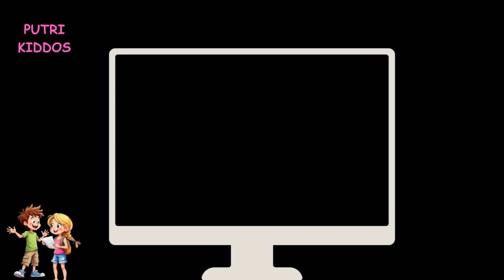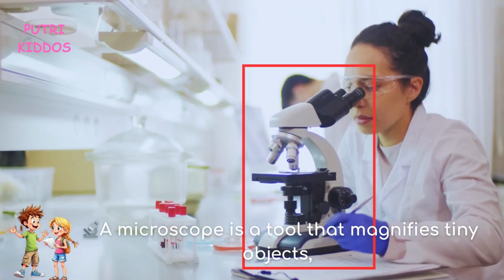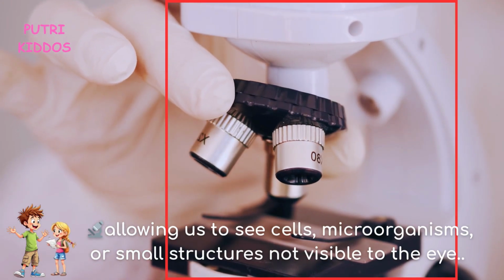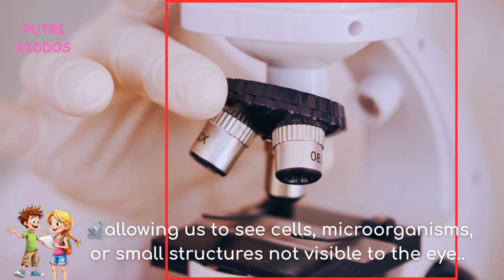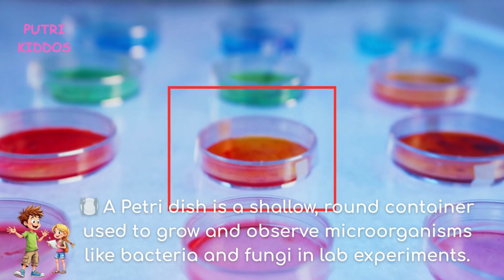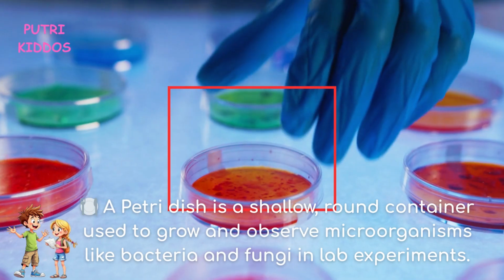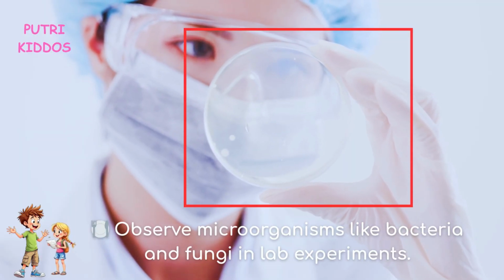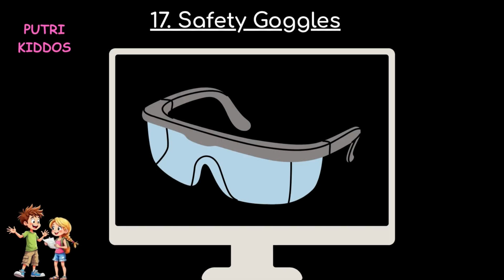15. Microscope. A microscope is a tool that magnifies tiny objects, allowing us to see cells, microorganisms, or small structures not visible to the eye. 16. Petri dish. A petri dish is a shallow, round container used to grow and observe microorganisms like bacteria and fungi in lab experiments.